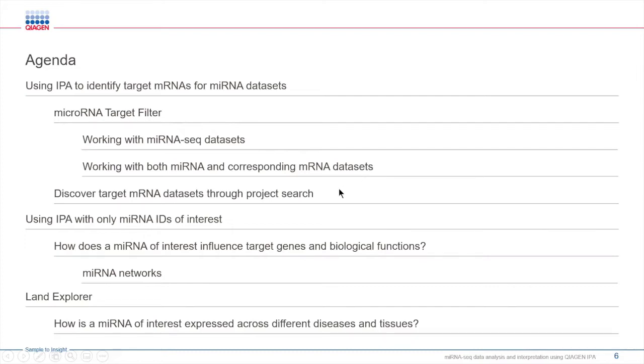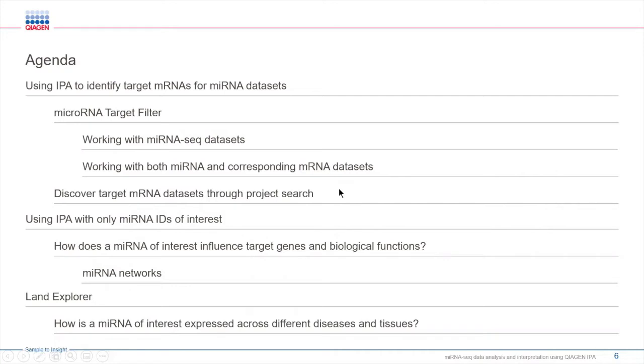If you don't have any mRNA data or you'd like to use a different mRNA dataset that you did not generate but read about somewhere, you will learn how you can find and use relevant mRNA data by taking advantage of IPA's large repository of datasets and expression analysis from the public domain.